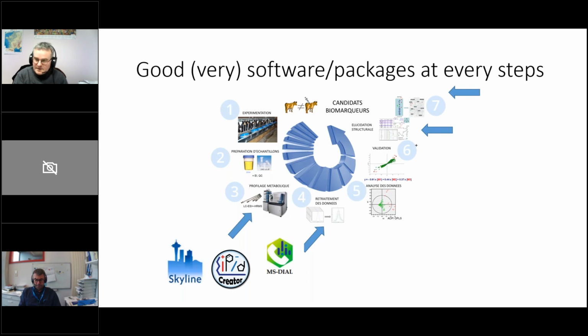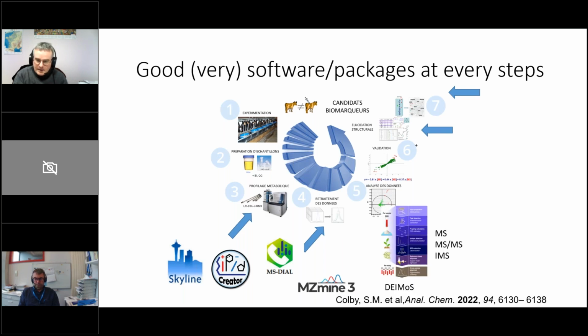So we have seen that in the survey, MS-DIAL is one of the software that you commonly use in your platforms and during your analysis. MZmine was the first one, and we are now seeing others. So I would talk a bit about Deimos.